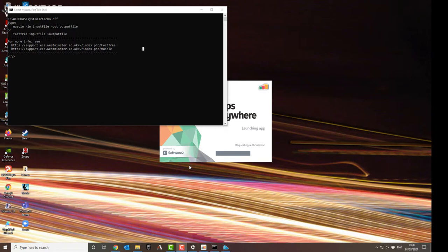So the DOS prompt shows you where you are. In this case, it's showing you that you're on the H drive. This is where you would have personal file space on university computers. It might open in another location on your own machine. Mine opened in H as I have an H drive, but it's not where the files are that I want to use.